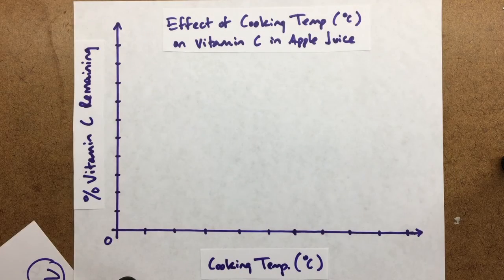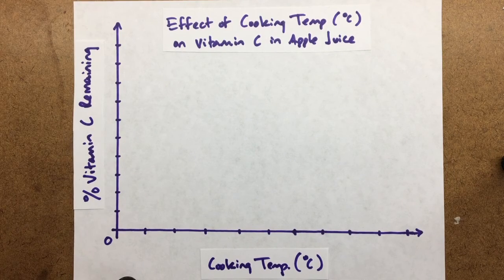So these are some things that you can do to go ahead and get yourself prepared so that when I put the actual experiment video up next, you can record the data in the data table, and then you can use those data to plot the graphs. I'll put some more demonstration about how to do some of the calculations as we get to that part.